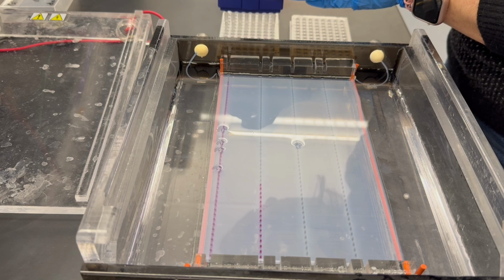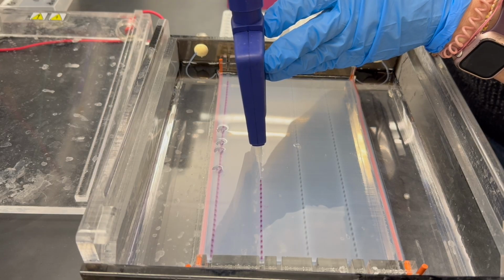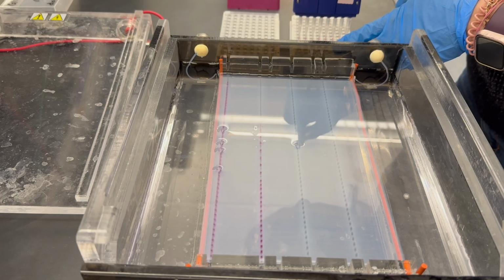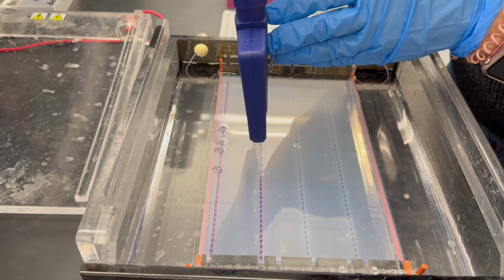After the PCR has finished, we use a small amount of the PCR product to load onto a gel so that we can visualize how well each sample has amplified. And we load the replicates side by side, loading both plates at once so that we can visualize all of the samples.